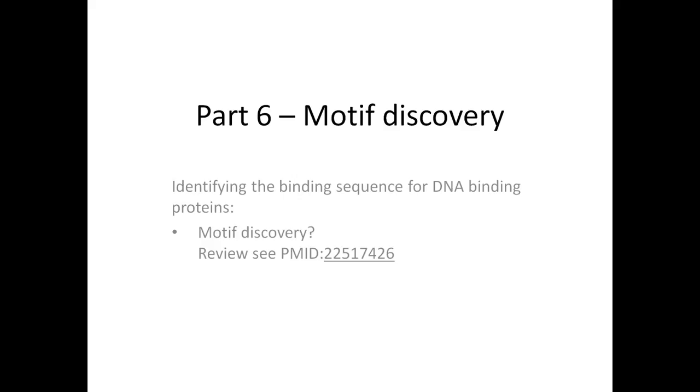Motif discovery can also discover the motifs of other transcription factors that bind close by and are required to work in tandem, or act as pioneers to modify the chromatin landscape for the protein to bind efficiently. There are plenty of review papers on the subject, but the PubMed ID I've included here links to a good all-round review.